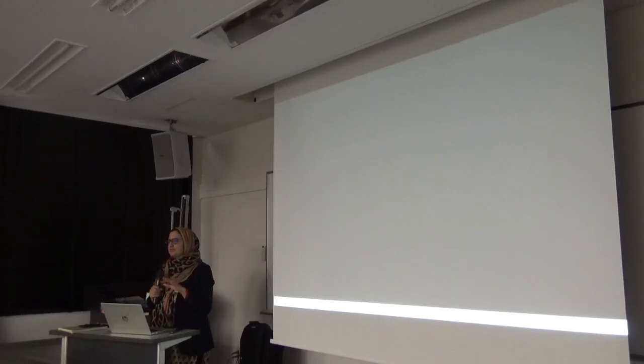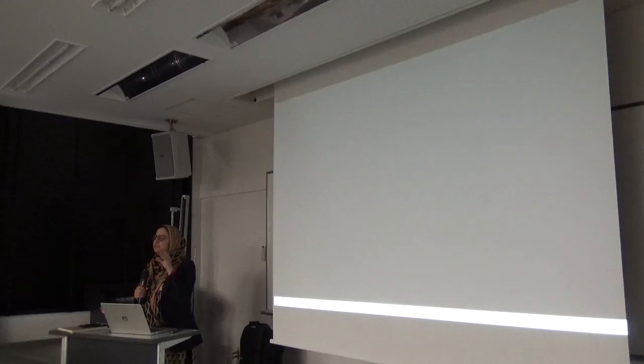Actually, when I treated the crust with the lysozyme, it totally changed its structure to spike. But the degradation we see in the spike is probably because of some components of that crust, or maybe an artifact. For example, sometimes we do some quick freezing, and during that we could see some artifacts, kind of unnatural structures.